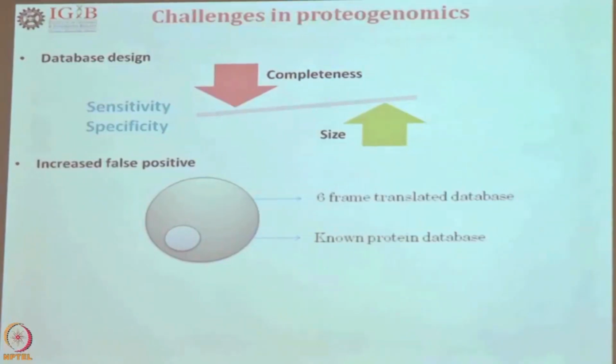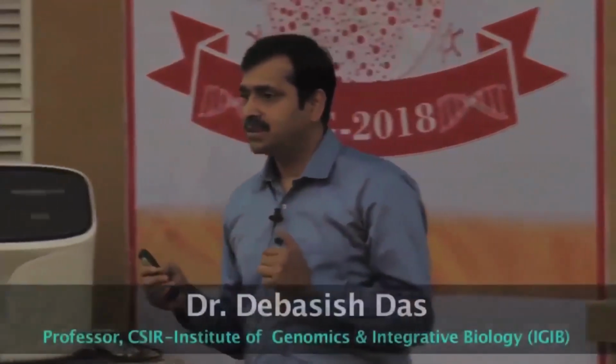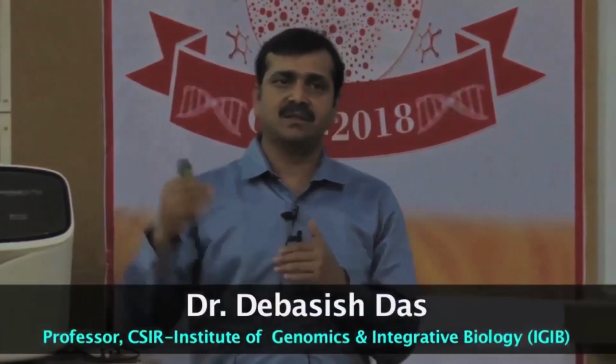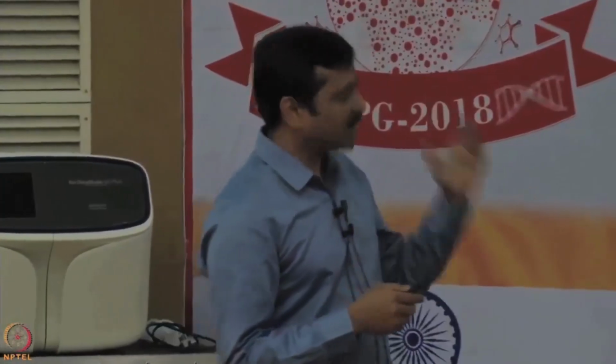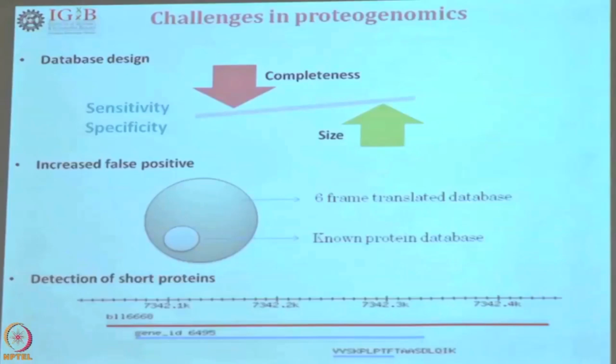How? Suppose you are looking for a place, let us say Bhubaneswar, and I have given you only the map of Orissa. Once you find it, it will be correct. But if I give you a world map and ask you to search for Bhubaneswar, there are chances that you will find another city with a similar name, with one letter changed here and there, and then you get confused about which one is right and which one is wrong. The same thing happens as soon as you increase the database size: your false discovery rate increases. But you have to do proteogenomics, so the database size has to increase.